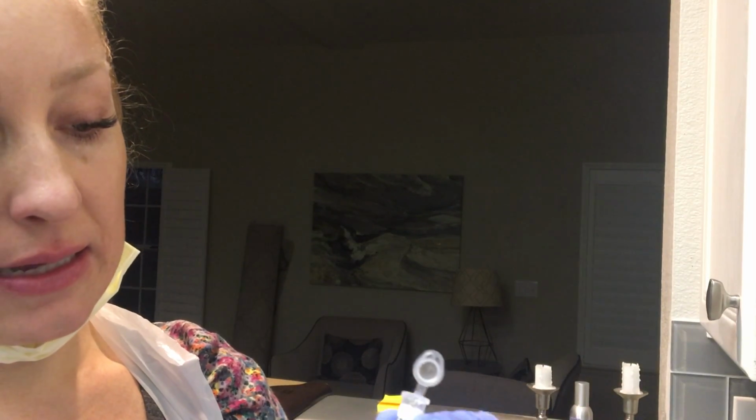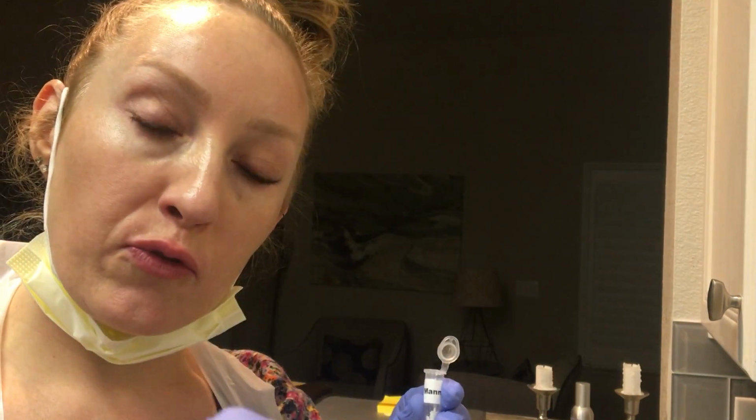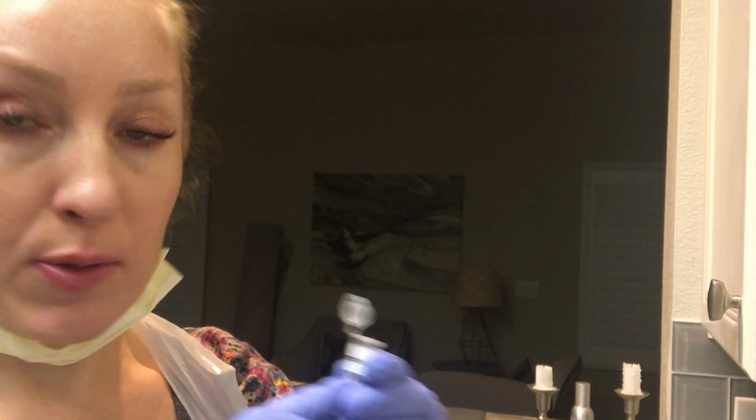So we have these little tiny vials that we had to split up between each one, right? So there's 2 for glucose and 2 for fructose and then 2 for the mannitol. So we have 1 more mannitol to do, and I will do that with you.